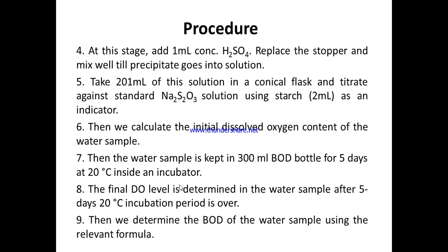Okay, so the final DO level is determined in the water sample after 5 days at 20 degree centigrade. Incubation period is over and then we find out the BOD by the formula: initial DO minus final DO, because initial DO is going to be more than final DO. इनिशियली DO ज़्यादा होता है, फिर DO घटने लगता है. 5 दिन के बाद DO लेवल काफ़ी कम हो जाता है. So that initial DO, which is higher one, minus final DO gives us the quantity of DO that is consumed in oxidizing the organic matter.